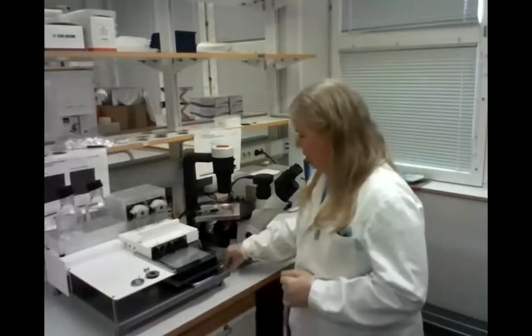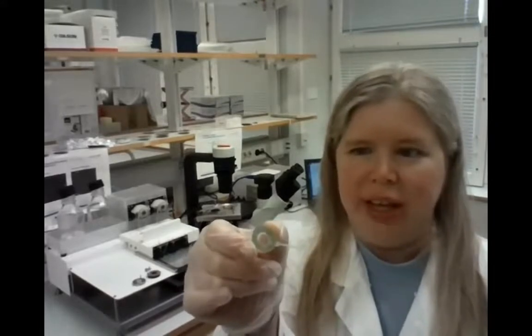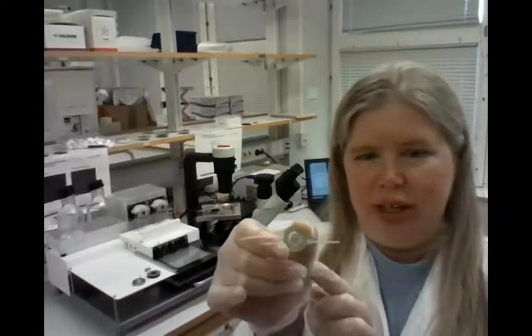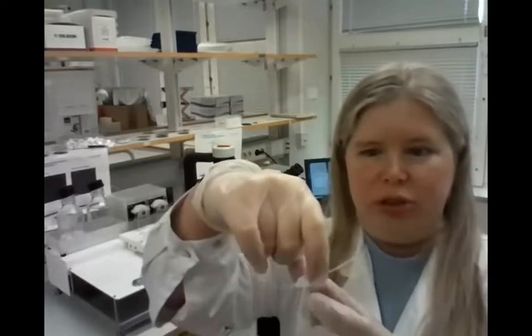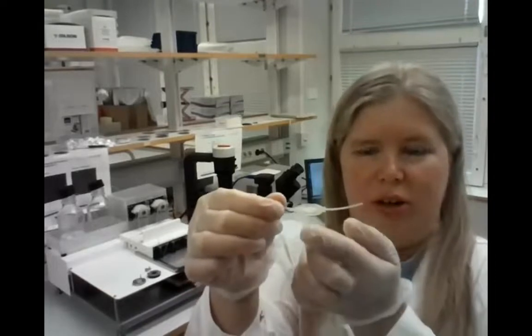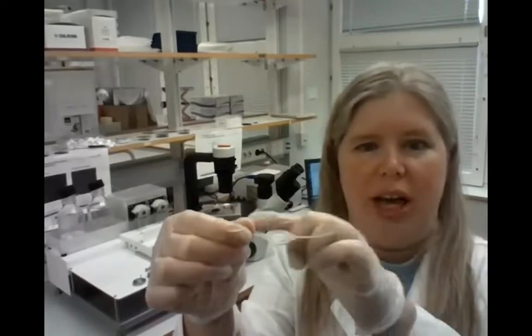And then we have the dissolution chamber, where we will apply our mucus simulant, as I talked about before. The mucus simulant will be applied on this side, and the thickness of the mucus simulant is defined by this green ring, and it will be 50 micrometer thick. And here you also see inlet and outlet of the dissolution chamber. So the mucus is applied on this underside, and on the membrane, and on the other side of the membrane, the perfusate is pumped in and out.